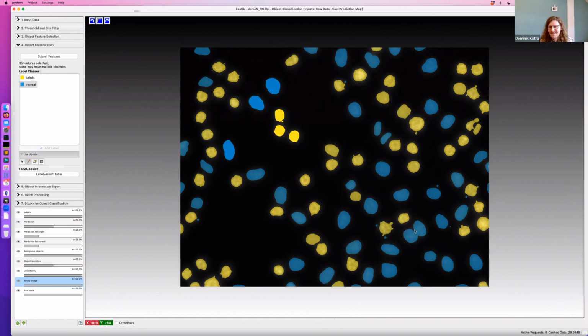What we can do now is add a label, for example, add segmentations, because I see some, and label these cells that are merged together, or these little things that are not really cells. Go to live update again, and you can see it has now recognized a lot of them as being bad segmentation, so we have to correct this.